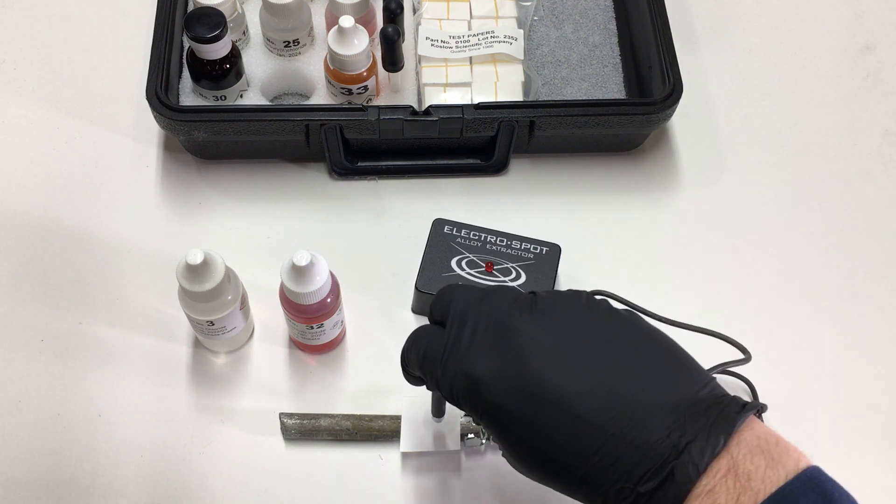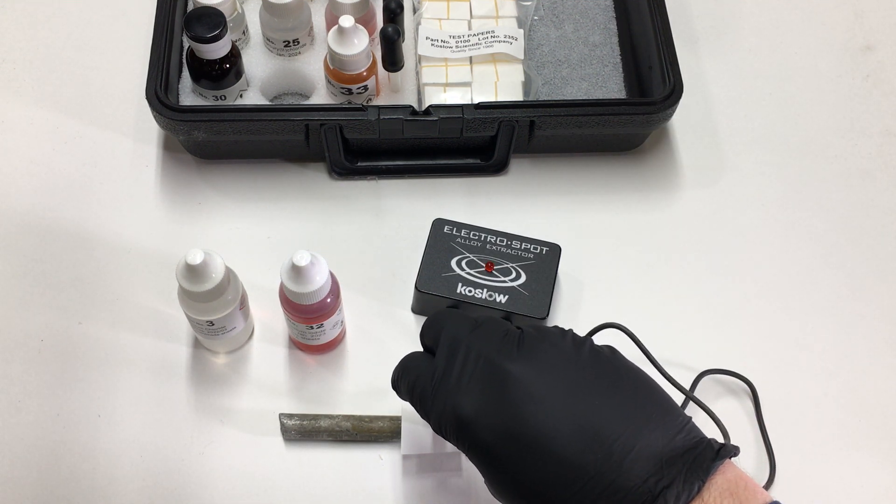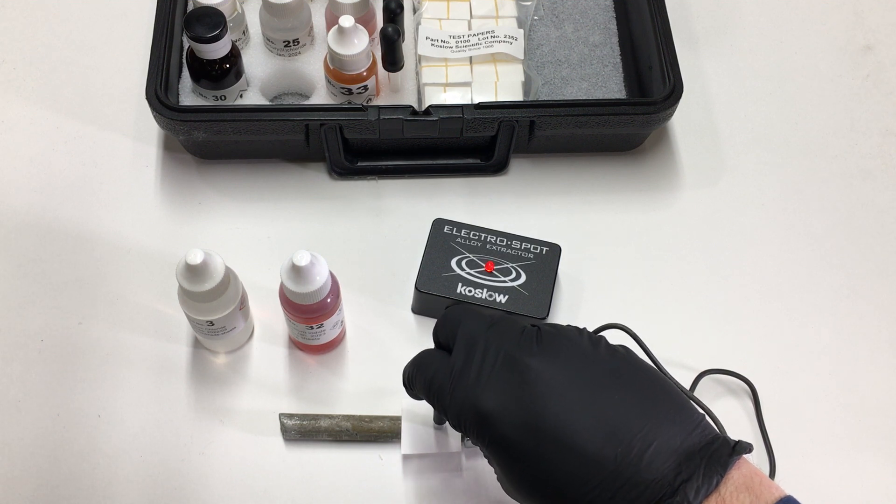Count for about five seconds. One, two, three, four, five.